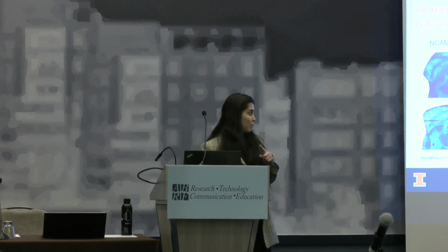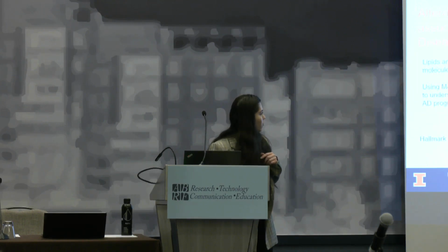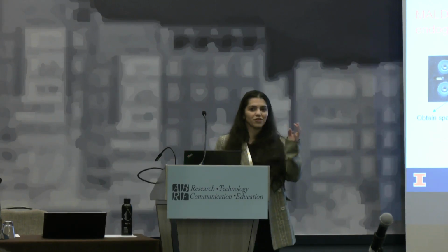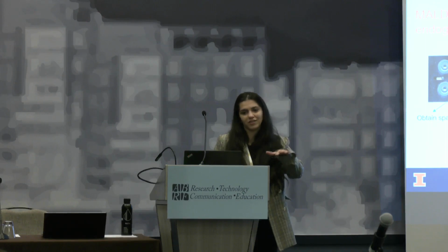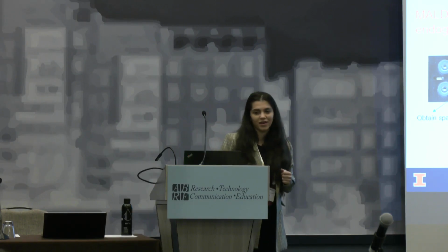But as far as sample prep, I feel like I didn't answer that. In the sample prep procedure, you can do sublimation or recrystallization, where you mix an organic solvent with your matrix and then spray it onto your sample. There are specific instruments you can use, and then the solvent evaporates and a crystal lattice is formed, which is basically a crystal of the analyte and the matrix.